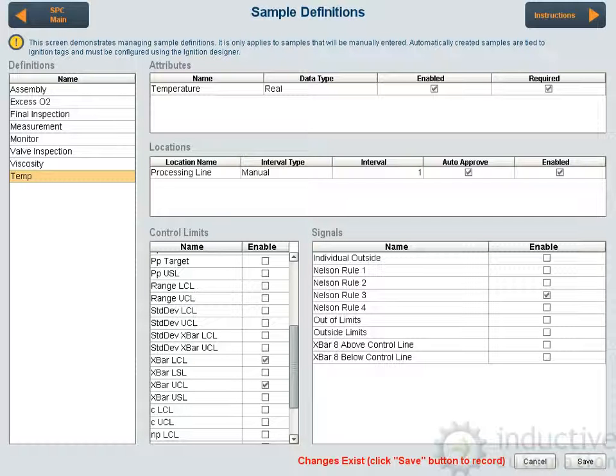So that's how you define a sample. Any time an operator or lab technician enters in a sample, based on this definition 'temp,' it's going to use that data. Here you can save or cancel that entry.